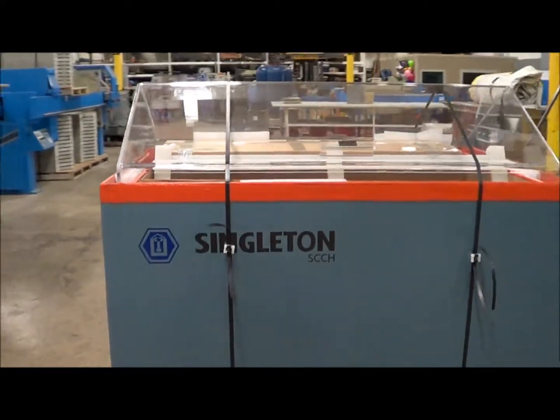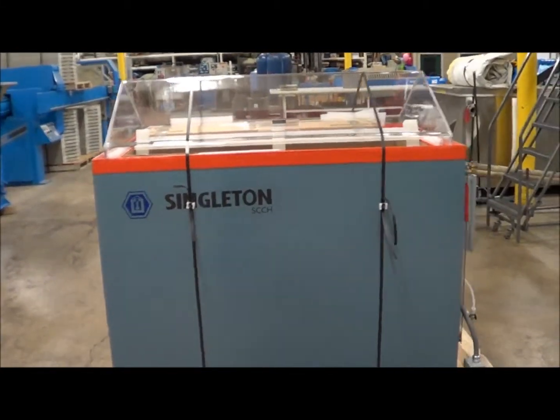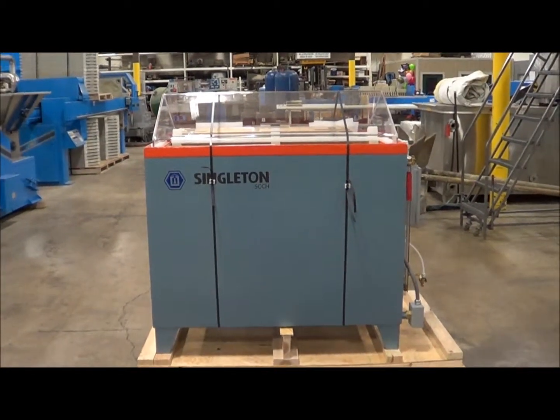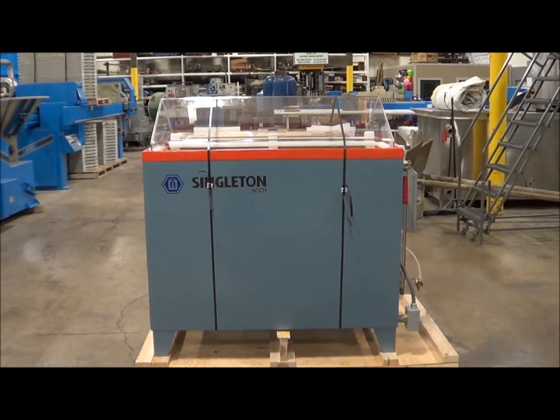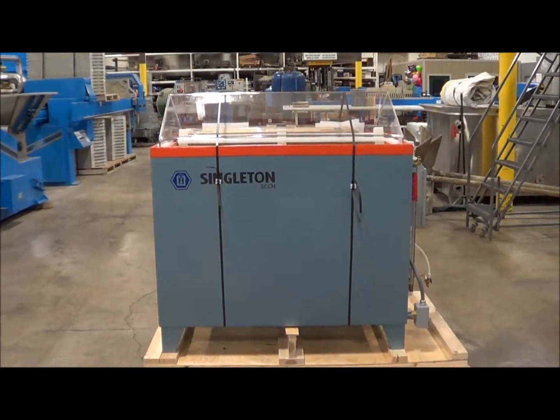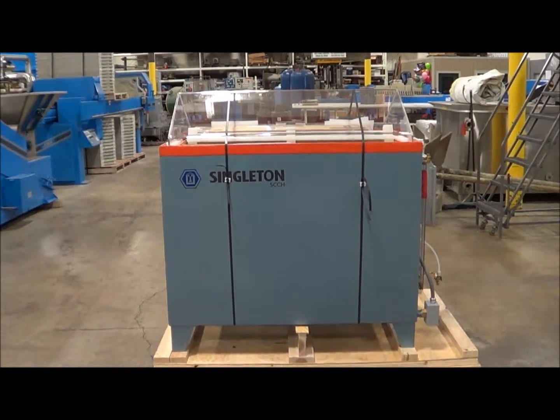This unit is currently available from Lanco Corporation. If you're interested in purchasing this unit or have any questions, please contact us at area code 616-887-8300 or online at www.lanco-corp.com.